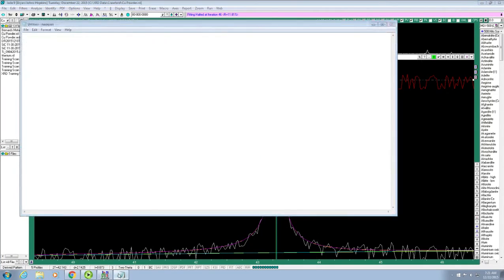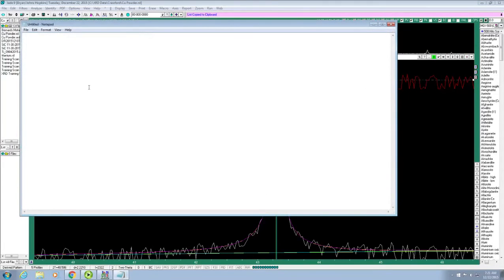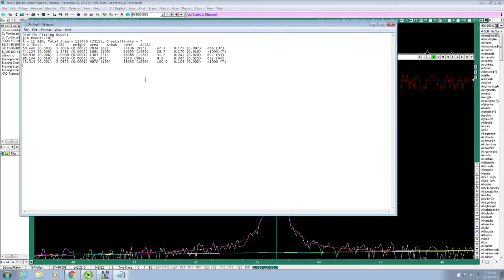So we opened up Notepad here. Now let's just go and tell it to copy it, and we can copy all to the clipboard. So we hit Copy, go to Notepad, and we paste it. And notice that because of the spacing between the columns, it gives you a little bit of trouble in aligning these columns, but you can do that manually before moving on. Good, so we have that information.